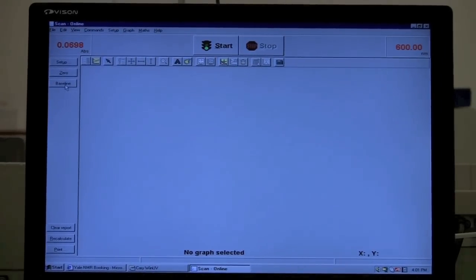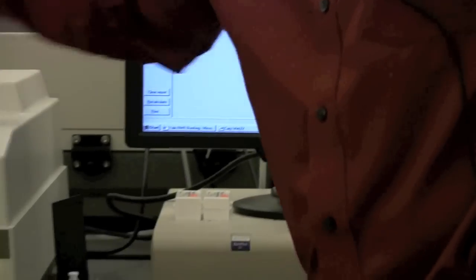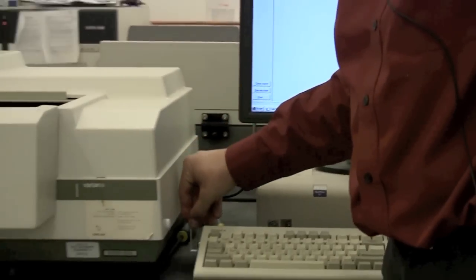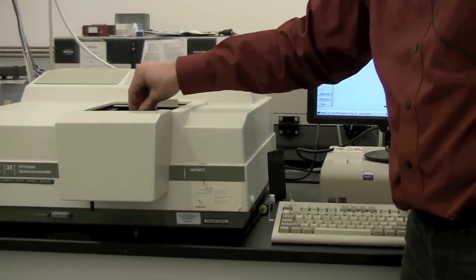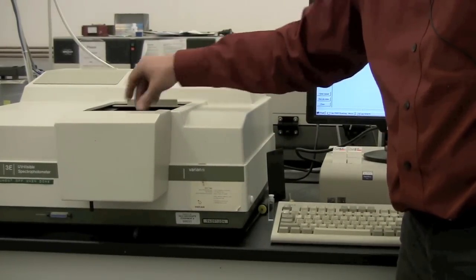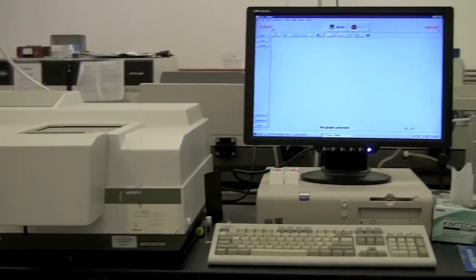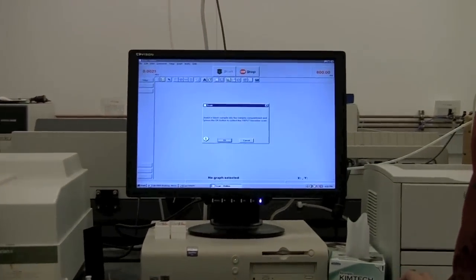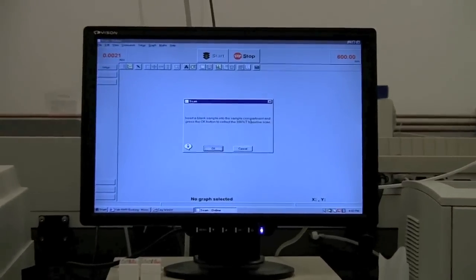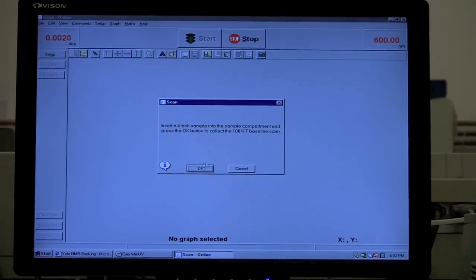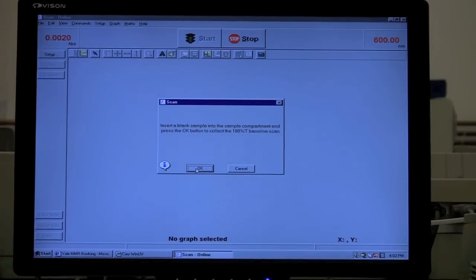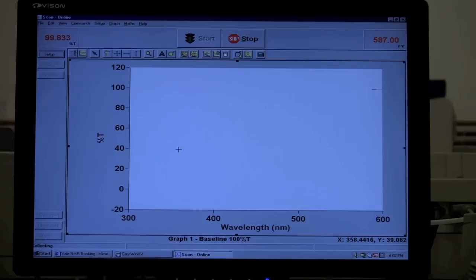And we have it set to collect a zero and a baseline, so we'll say OK. So to do the baseline, we'll put in our blank sample. Click baseline. It says insert the blank sample. Click OK to collect the 100% transmission baseline scan. Click OK. It is scanning through the range for the 100% transmission.